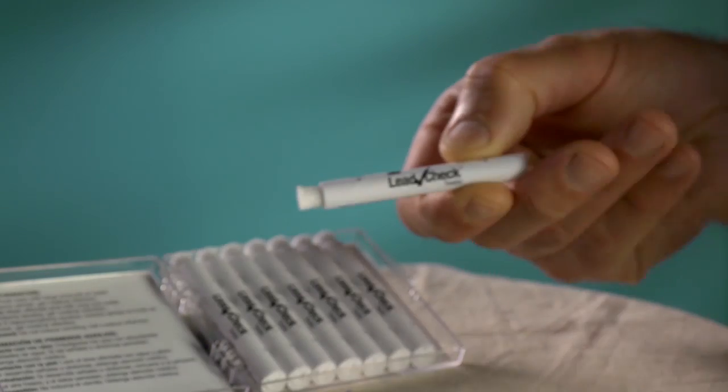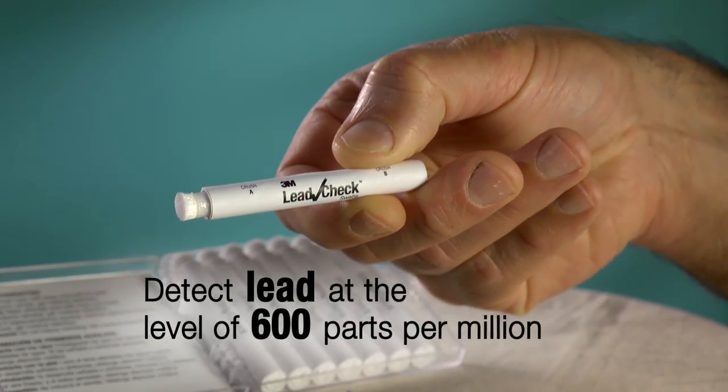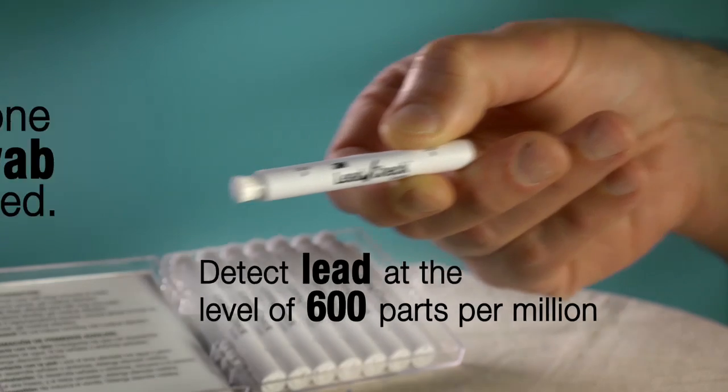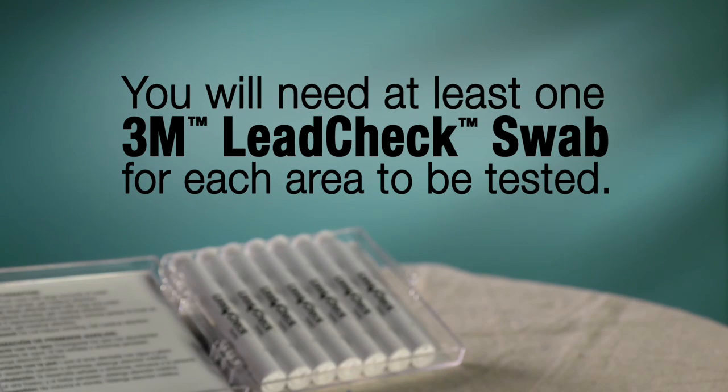3M LeadCheck swabs can detect lead at the level of 600 parts per million. Note, you will need a separate 3M LeadCheck swab for each area to be directly tested.